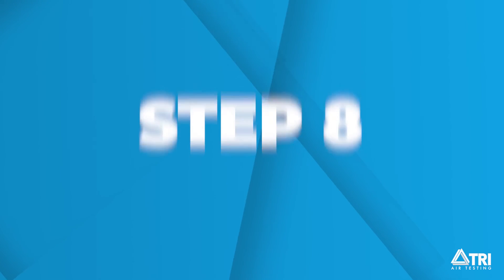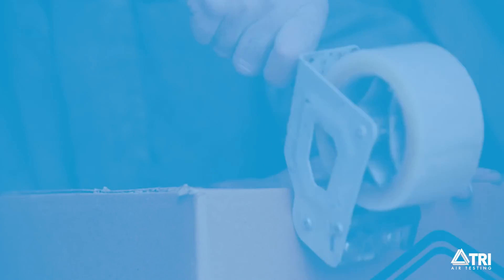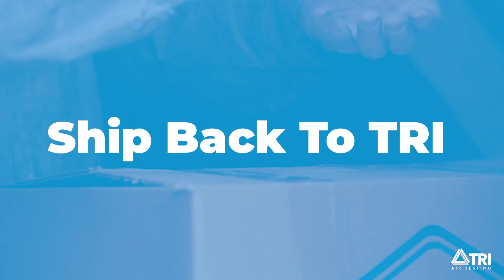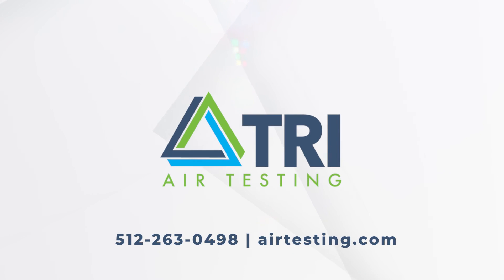Step 8. The final step is to ship back the datasheets and kit to TRI air testing. Shipping instructions are included in your kit. After shipping the kit back, there's nothing left to do except wait for the results. You will get a reminder when it's time for your next air test. For any questions and additional support, go to airtesting.com to contact us.